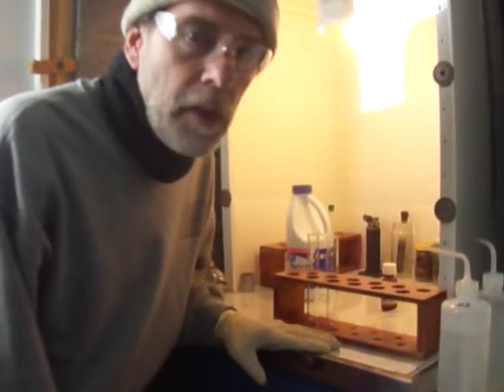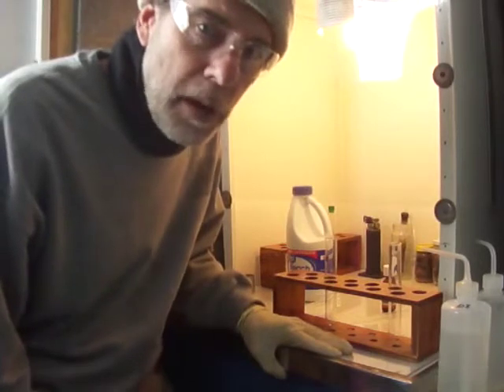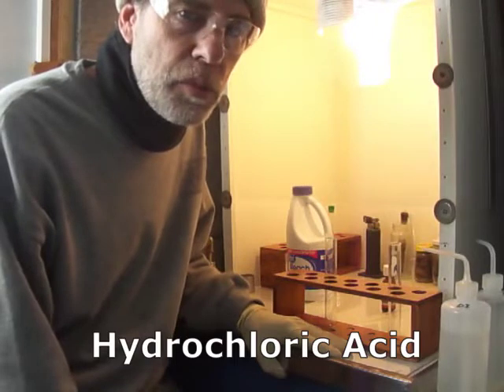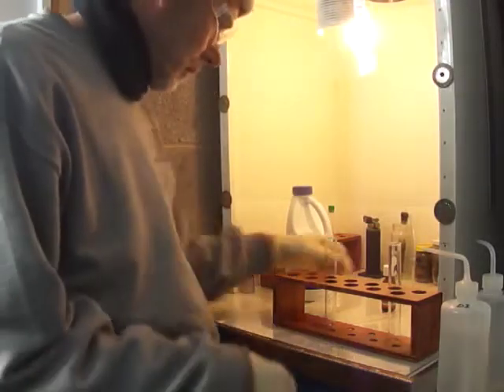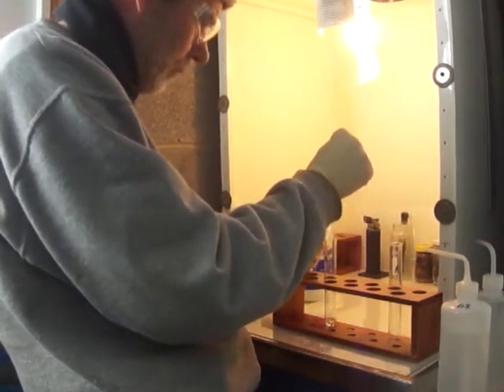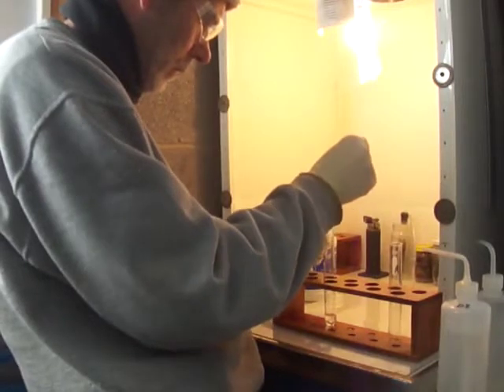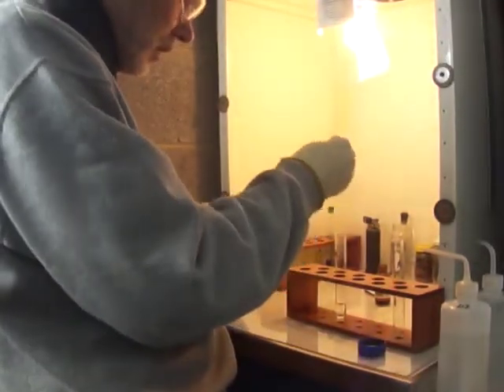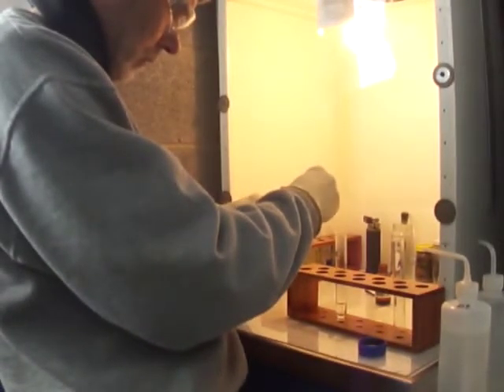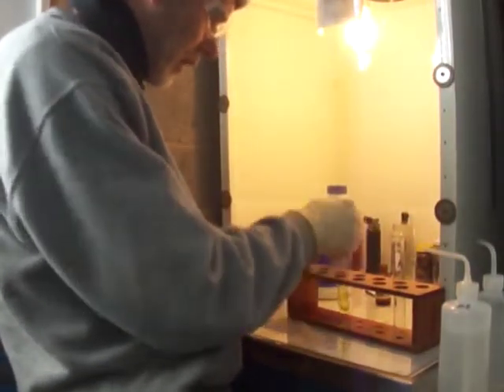I'm going to try two different methods to dissolve the gold. Let's do the bleach first. I've heard ratios anywhere from two parts acid to one part bleach up to four parts acid to one part bleach, so let's split the difference and try three to one. We'll add six mills of acid and then two mills of bleach, then stopper it up so the chlorine doesn't get out.